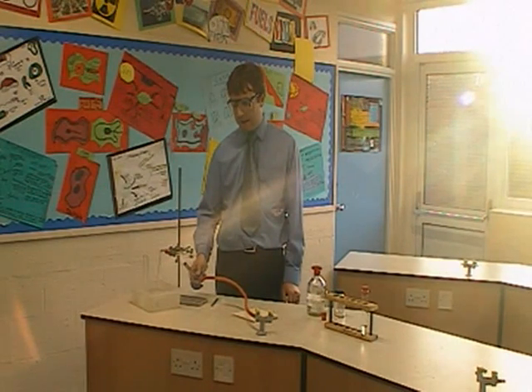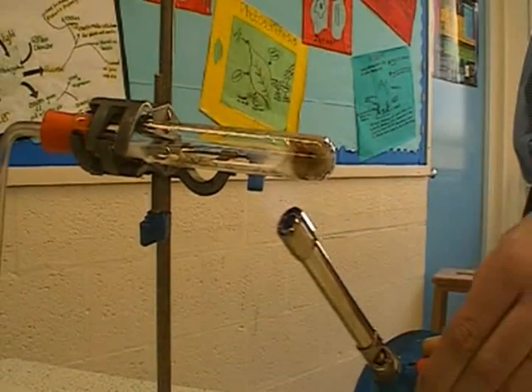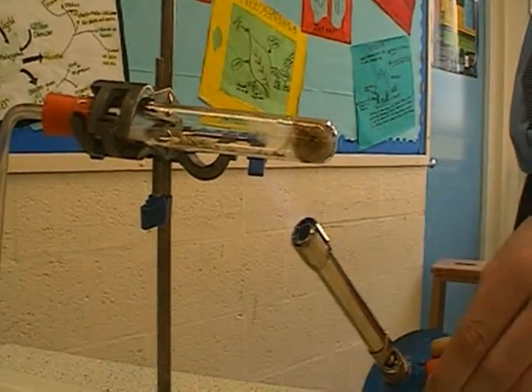Every now and again I need to draw the heat across to the oil and back to the catalyst, and keep moving the heat backwards and forwards until the reaction is finished.